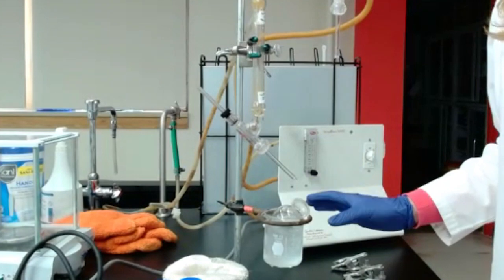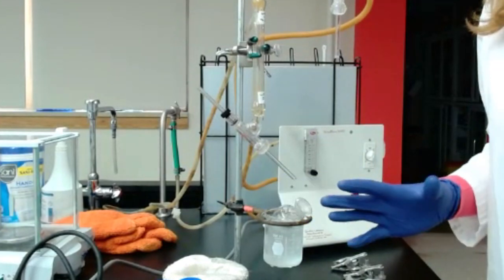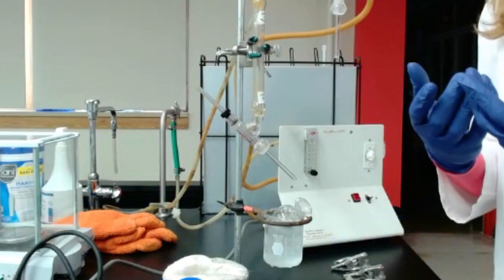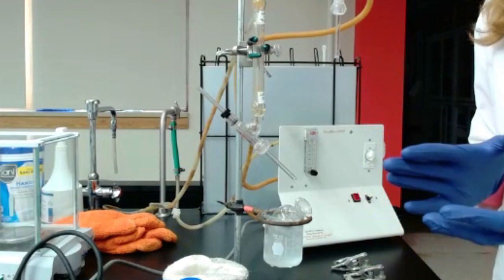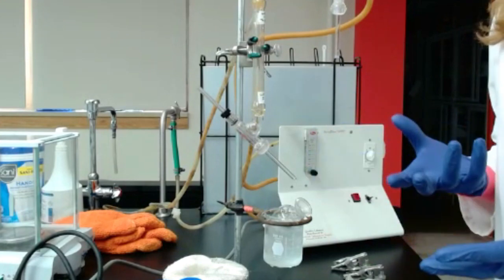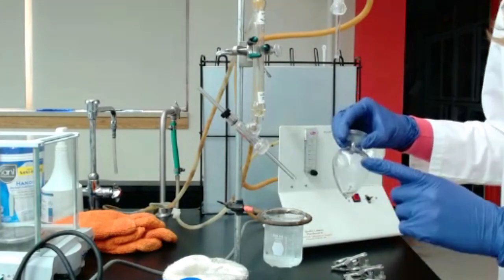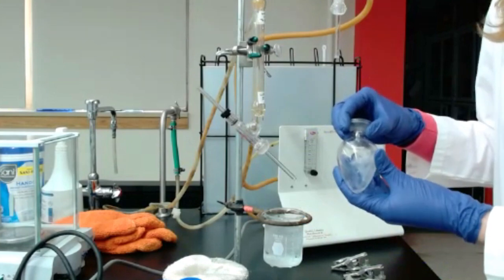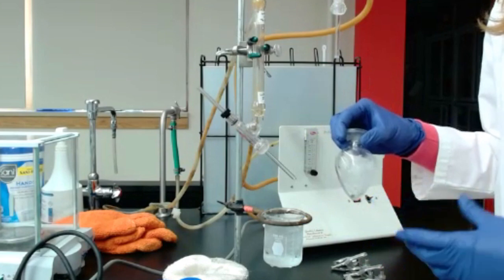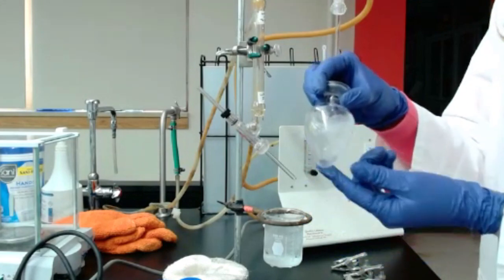Also, before starting to measure free SO2, that's really to look at how much volatile or free SO2, so everything that is not bound with any other compounds, you have in your wines. To avoid releasing anything bound, you will need to have your flask in a cold environment. Because if you heat, that's how you're going to release the bound SO2. So today we're going to start with free SO2. Make sure this flask is cold.